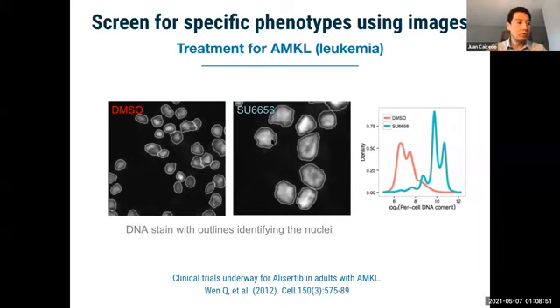There is one property in this case which tells us when the cells are healthy again. So in the image on the left, we see sick cells, which are treated with a neutral compound. And then on the right, sorry, we see images treated with one specific compound, which was one of the candidates, in which the cells recover their normal size.